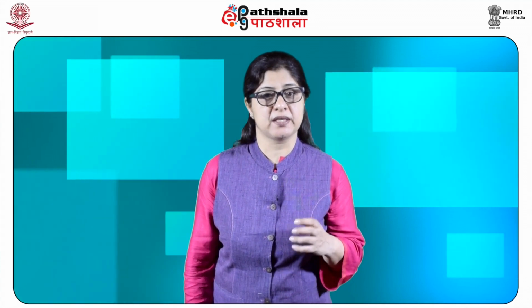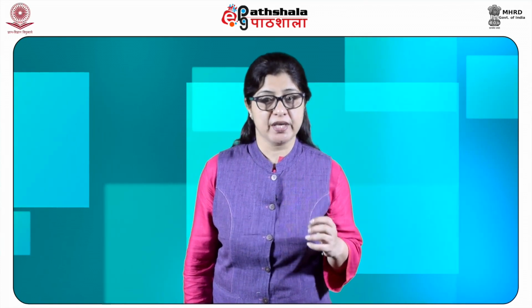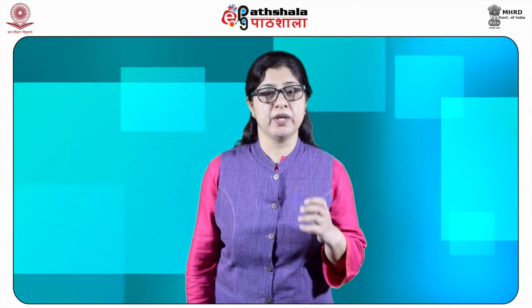This is called the total ion exchange capacity. It is expressed in terms of milli-equivalents per gram of ion exchange resin. The exchange capacity of a cation exchange resin is usually found in the laboratory by determining the number of milli-equivalents of sodium ions which are absorbed by 1 gram of a dry resin in the hydrogen form.